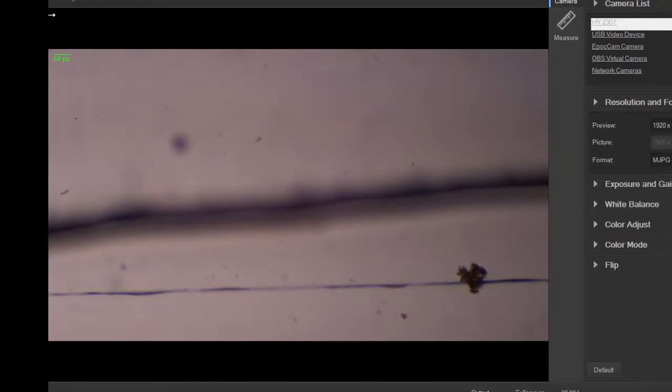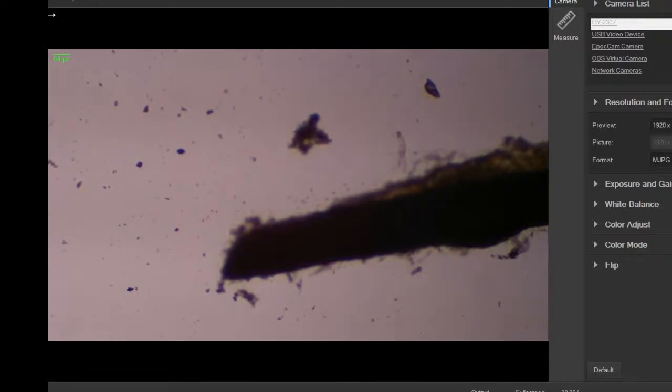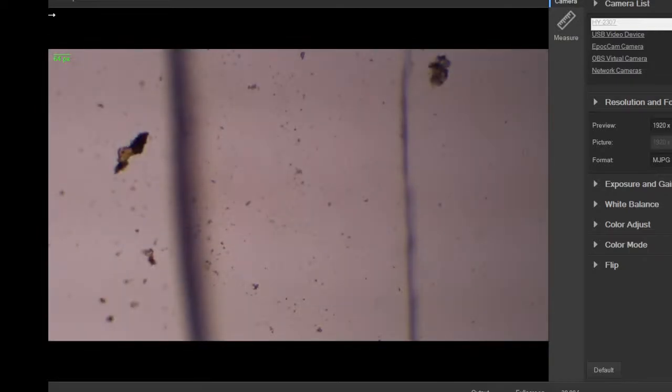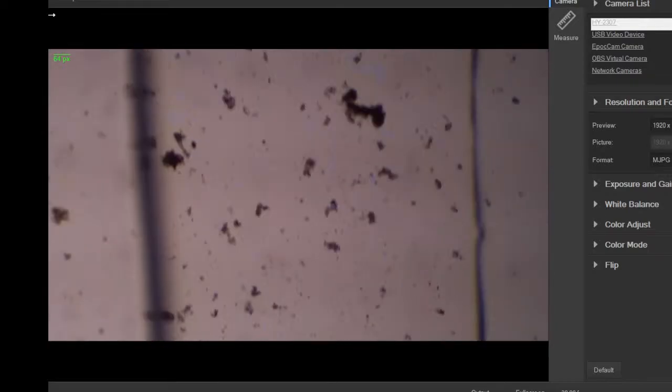Weird. I wonder if I got squashed on something. It's the only living area I've got left to look at.